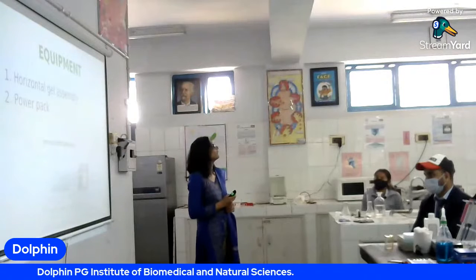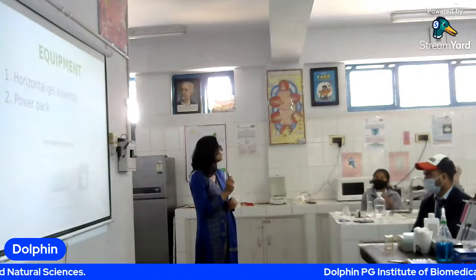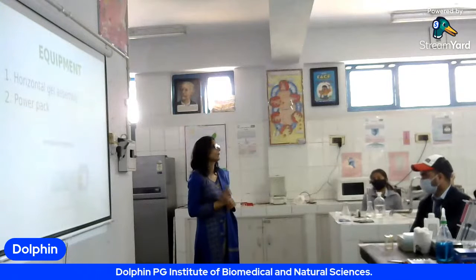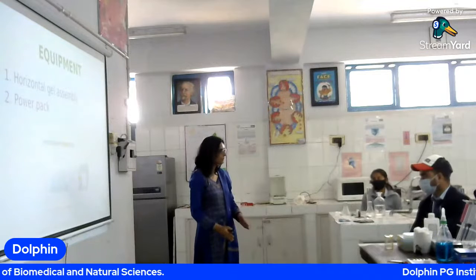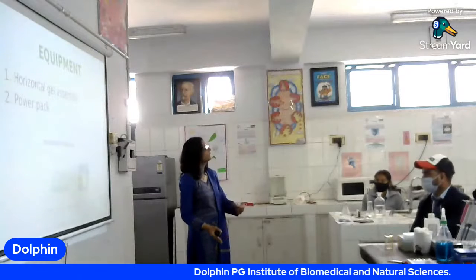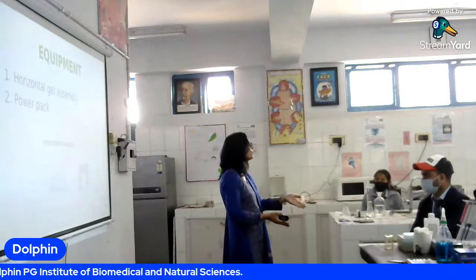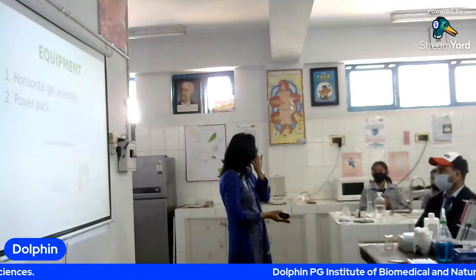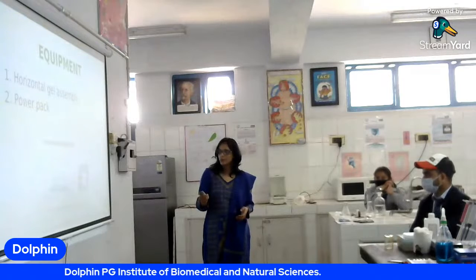Okay, how many of you have done the electrophoresis of DNA before? Those who are MSc students, I hope you have done the electrophoresis of DNA in your biotechnology experiments and molecular biology experiments. So even if you have not done, we are starting here from the scratch. You will get to see how do we prepare the gel, how do we load the gel, and how do we set up this assembly. Similar assembly is also used for the DNA electrophoresis. ये assembly है जो हम DNA electrophoresis के लिए यूज करते हैं. So we will see. Just I will demonstrate you how to use this assembly, how to make the gel.